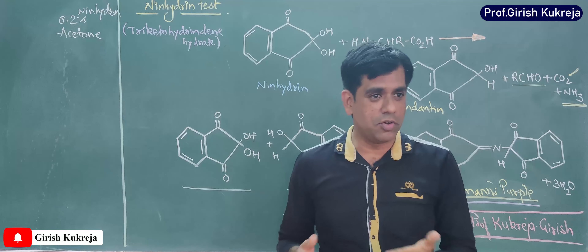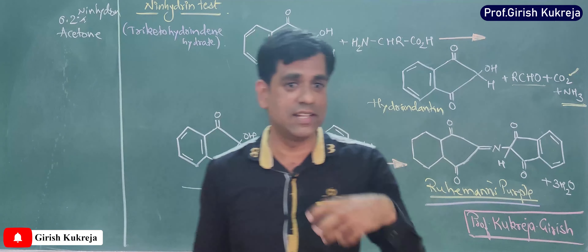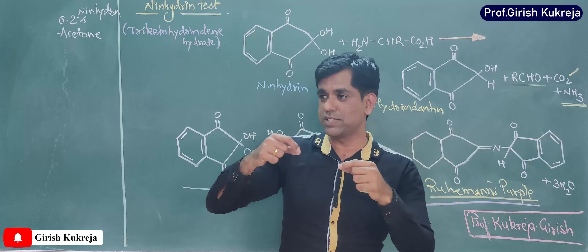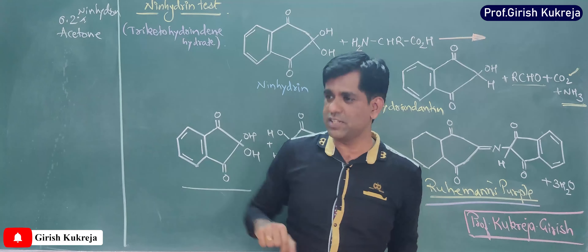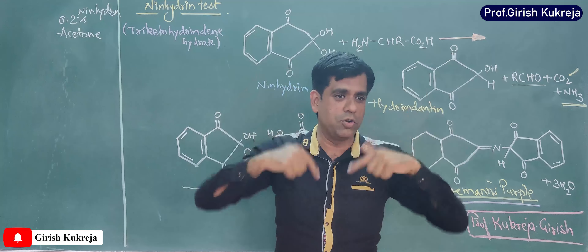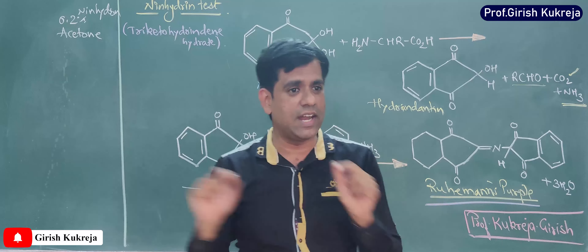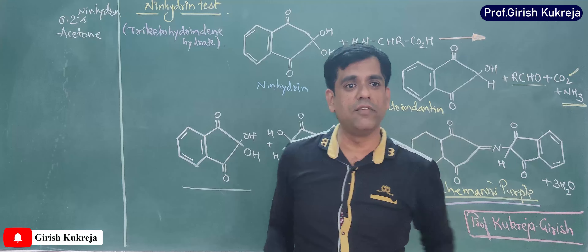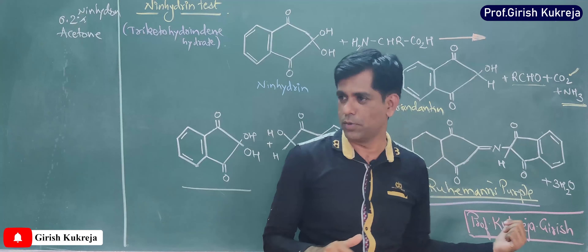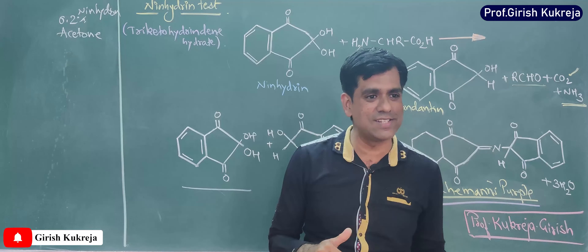If I do not get a reaction at room temperature, I boil it for 1 or 2 minutes at 100 degrees Celsius; a purple colored complex then indicates the presence of an amino acid. Similarly, this is the same ninhydrin reagent sprayed on the chromatography paper during paper chromatography of amino acids. The same 0.2 percent ninhydrin in acetone is sprayed and the paper is kept in an oven for a few minutes to develop Ruhemann's purple.